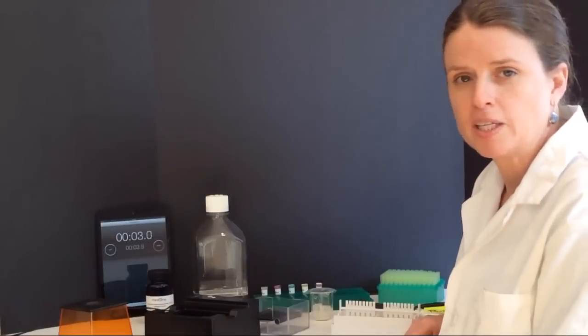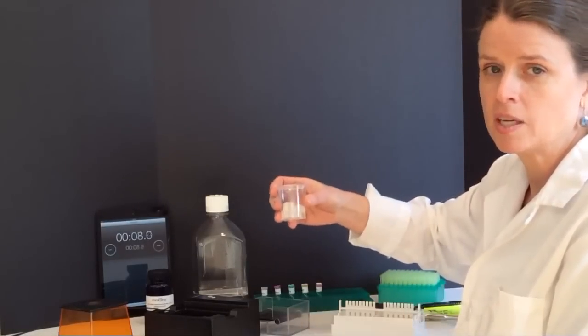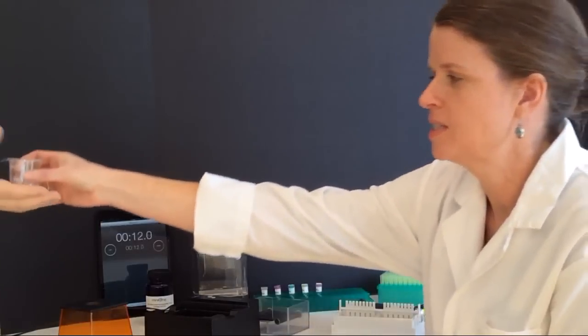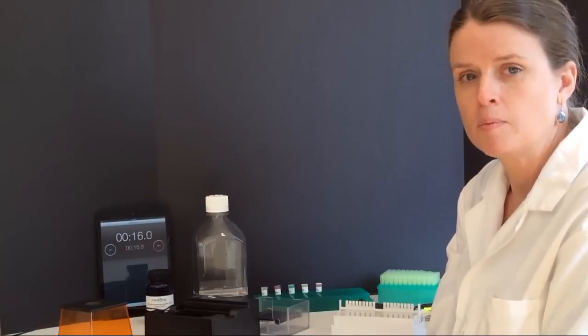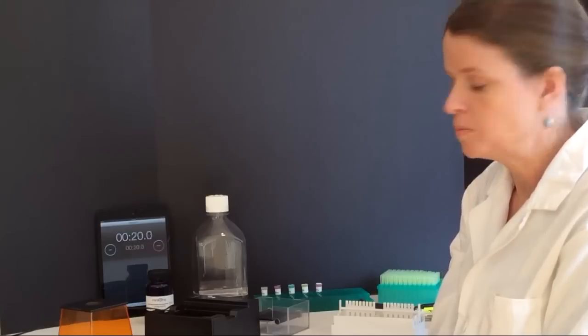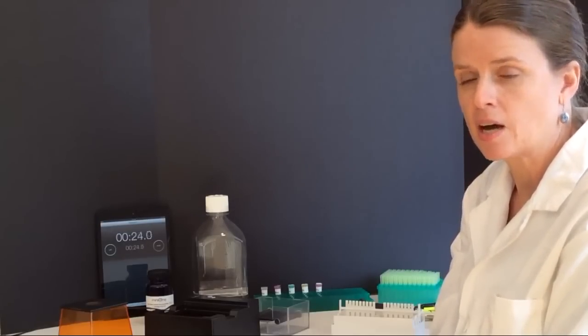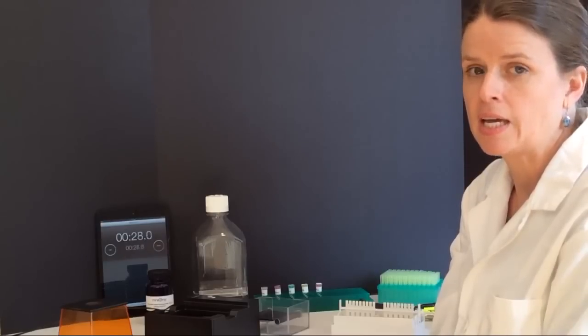The first thing we're going to need to do in our lab today is pour a gel. To do this, we're going to be using the Mini One's gel cups. I'm going to ask my assistant to please microwave our gel cups. The gel cups come pre-measured to pour a gel specifically for use with the Mini One System. It contains agarose and the gel green DNA stain.